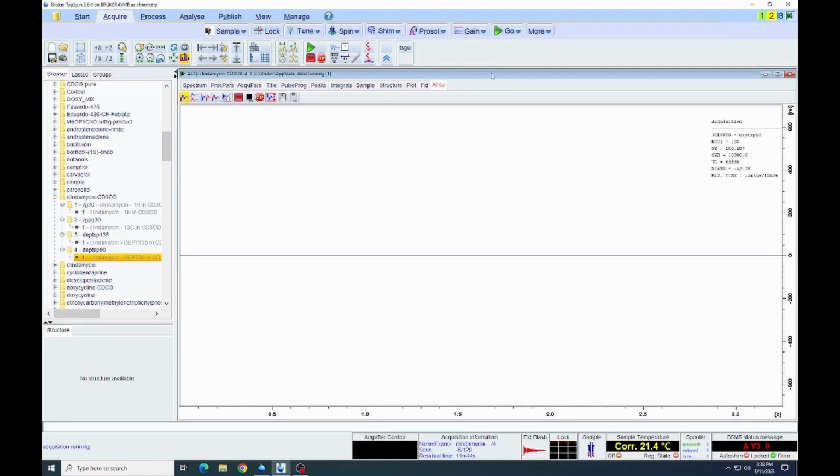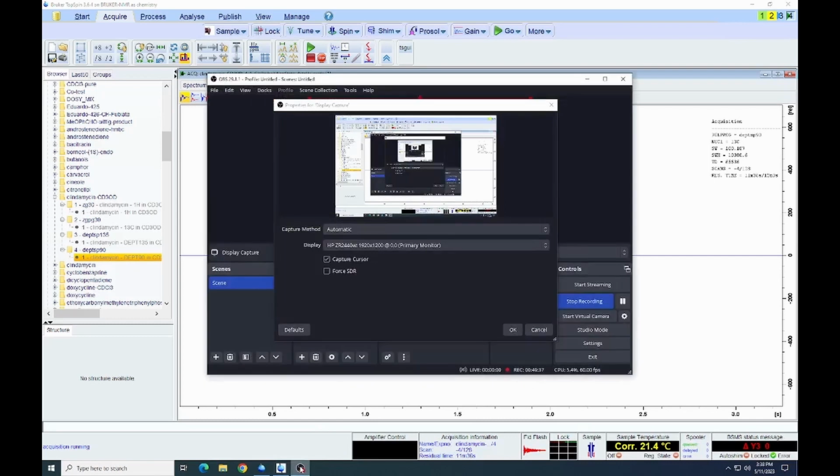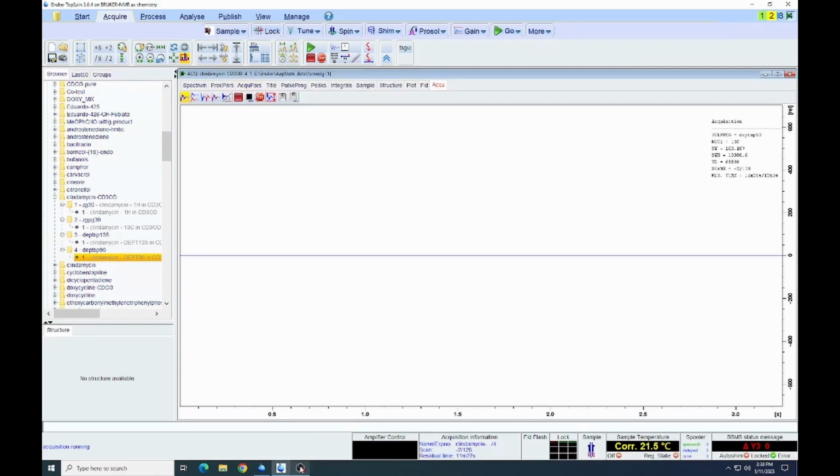We can look down below at the residual time and see that we've got about a 12-minute acquisition, the same as we had for the DEPT 135. As before, we will not sit here and watch the whole thing acquire. We will break the video and come back when this is nearing completion.